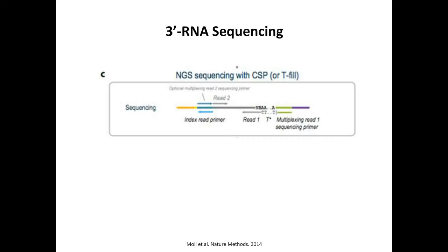So after synthesizing the cDNA library, they are sequenced, and you can find more information about how sequencing can be done in this paper, Moll et al. My talk will be about how we analyze this data after sequencing.